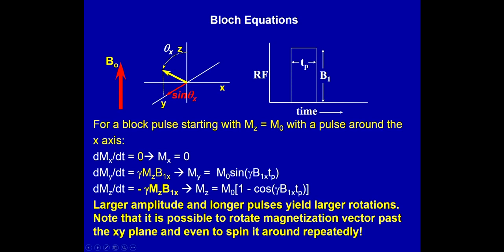We won't talk about it now, but we are able to determine about which axis we rotate. It could be about the X, Y, or something in between, but we rotate about something in the XY plane. And the vector moves to a right angle position with that.